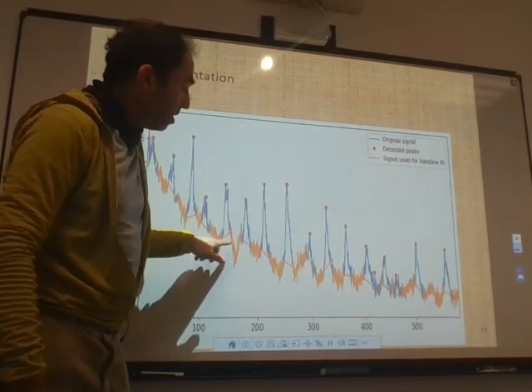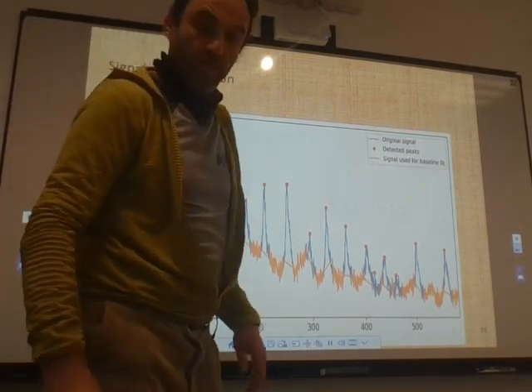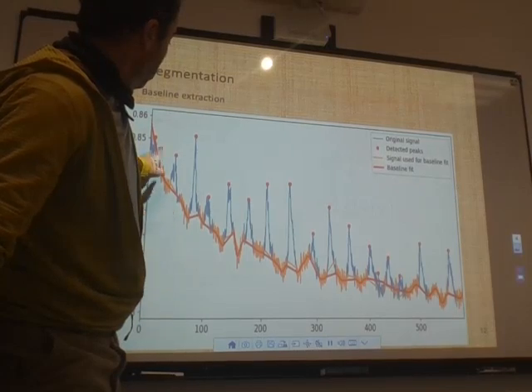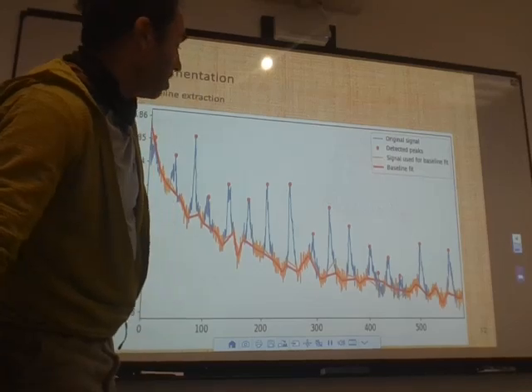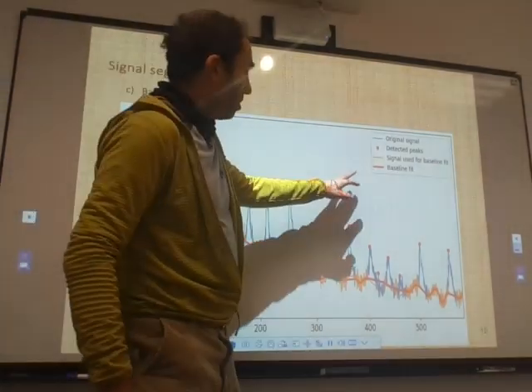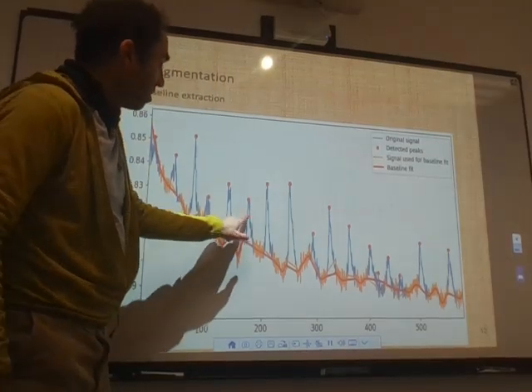The problem in the empirical mode decomposition here, you have some noise to be careful with because of the fluctuations of what you see here. So then you can again do this interpolation just on this orange curve, and once you have this, you subtract your baseline that you have found with the blue curve.